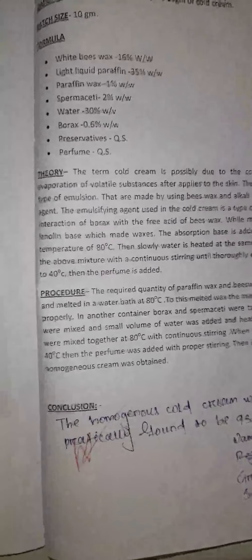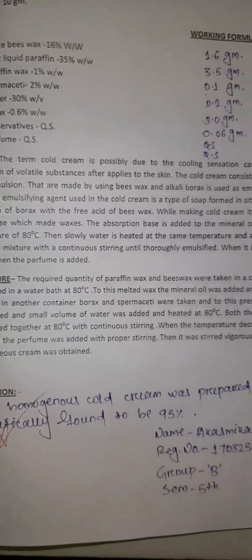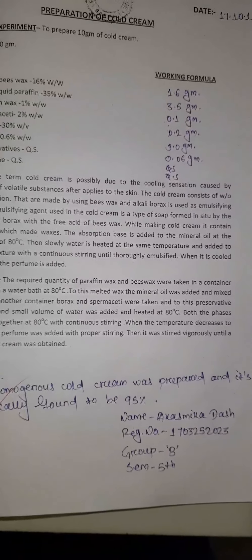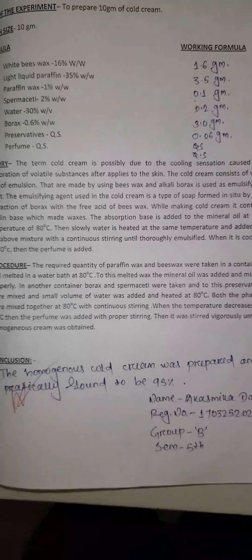Now the procedure part. The required quantity of paraffin wax and beeswax were taken in a container and melted in a water bath at 80 degrees centigrade. To these melted waxes, the liquid paraffin was added and mixed properly.